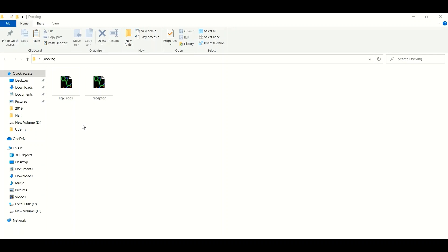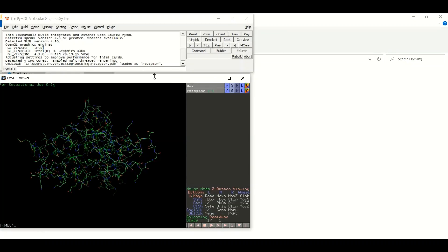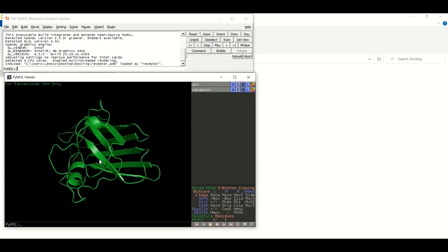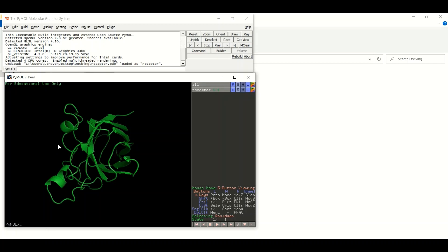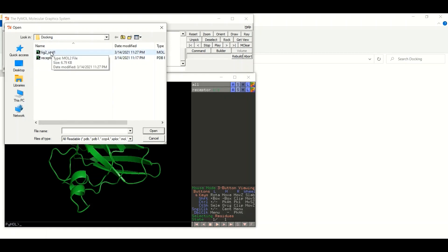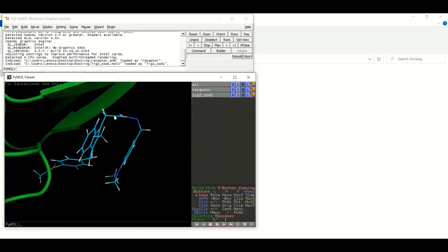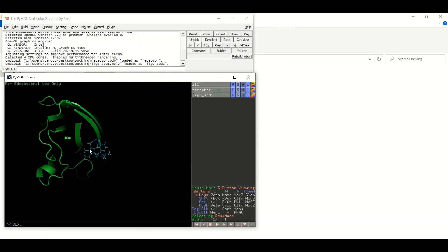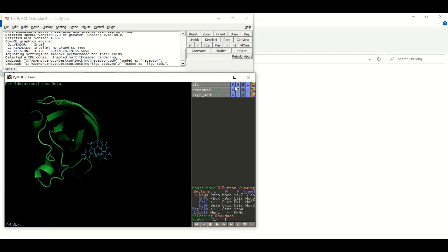The very first step in visual analysis of docking data is to open the receptor molecule in PyMOL. Let's double-click on it. This is our receptor molecule. Let's change the shape of the receptor molecule to cartoon. Now let's open the best docked pose of our ligand — click on File, then Open, and click on the best ligand docking pose. Let's zoom out the structure. You can change the shape of the ligand and the protein using the buttons present in PyMOL, but that is not the topic of our discussion right now.